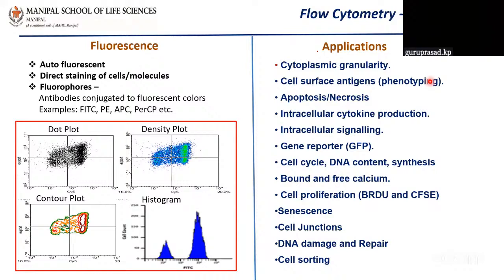How is it possible to identify them as B lymphocyte and T lymphocyte? You can do it in a microscope. You can add an antibody for T lymphocyte, tagged to one color, and another antibody for B lymphocyte, tagged to a different color. Afterwards, you smear it on the slide and observe under a fluorescent microscope.